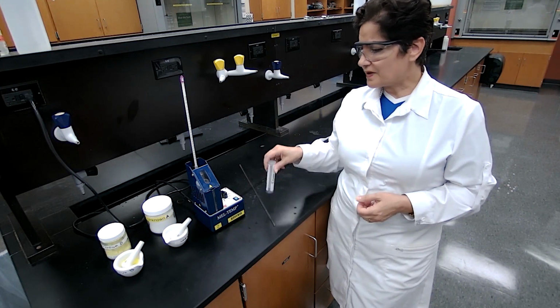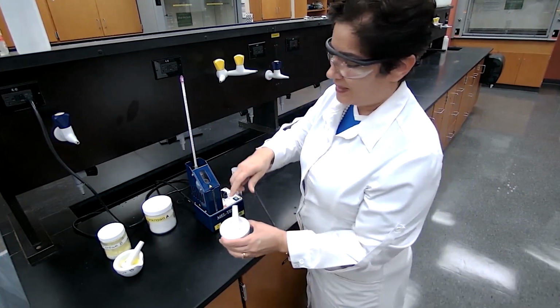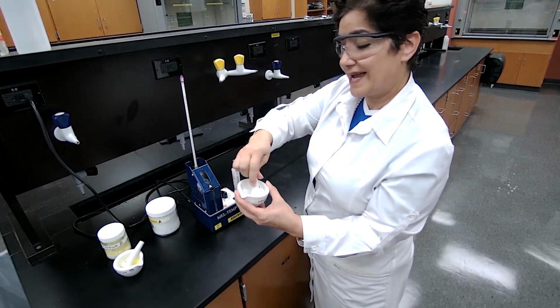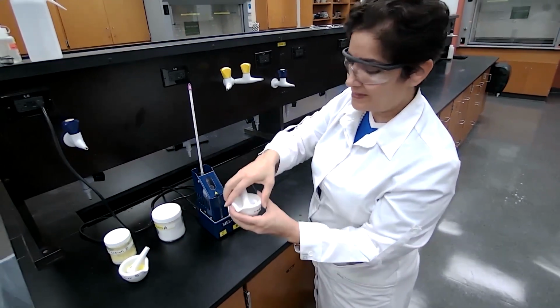Now, first, I'm going to start with unknown A. Your unknown A is a white powder. I'm going to grind it to make it powdered. It's going to react faster in the solubility test, and it is also going to fit into the capillary tube more easily.